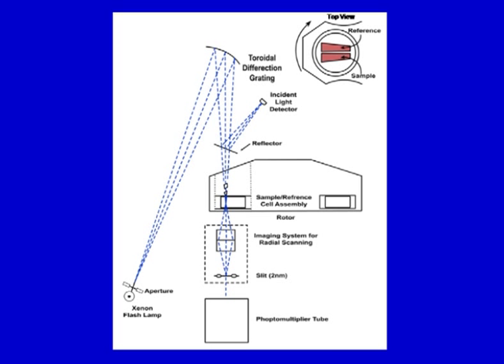If you see here, there is a reference cell, and they are sector shaped. If you can see, the diameter of this particular part increases as it goes from one side to another, so that there are no wall effects or sedimentation on walls actually, and they act as swinging bucket rotors only. So, this is how these are placed, and the analysis could be performed in here.